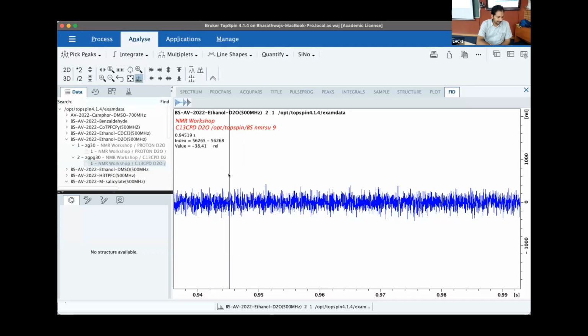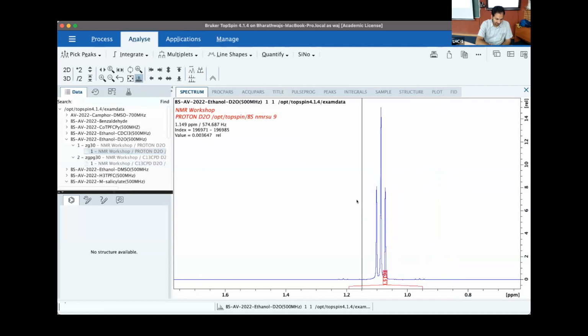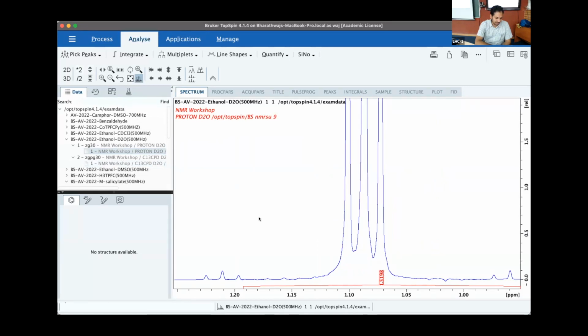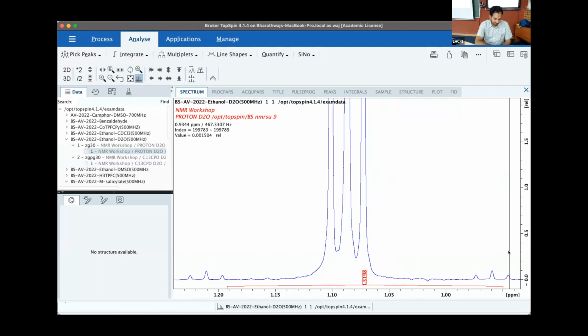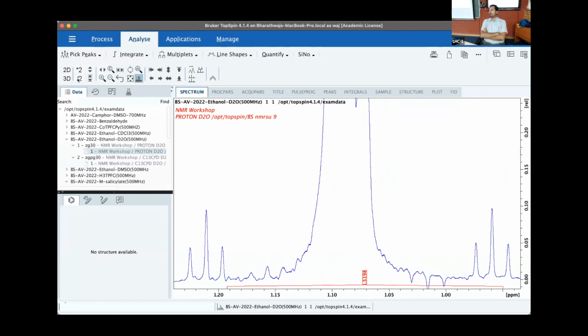So what you see here is an FID for a carbon NMR. And let's go back, if I end up expanding, you see the triplet. The triplet corresponds to the proton. Correct? What he wants to know is that we spoke about the satellites, and he saw the satellites. Do you guys see the satellite peaks existing? Right? So the 2 triplets that are there on either side of it are the satellite peaks.